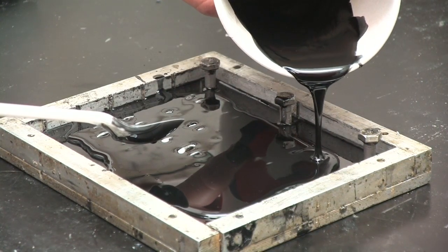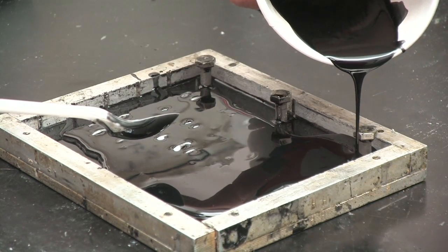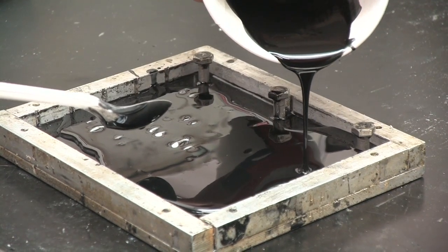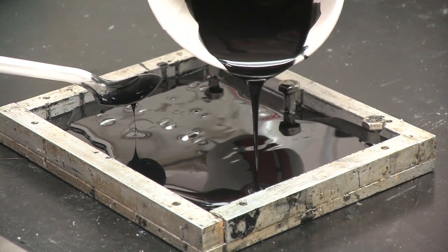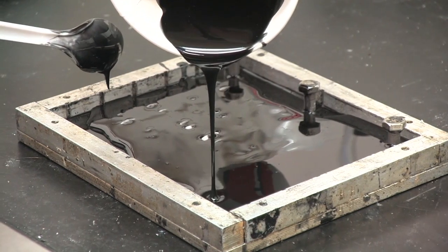Once the otoliths have a good cover on them, you can continue spooning or pour out the rest of the resin so that it fills up the corners and brings the level of the resin up to the edge of the tray.